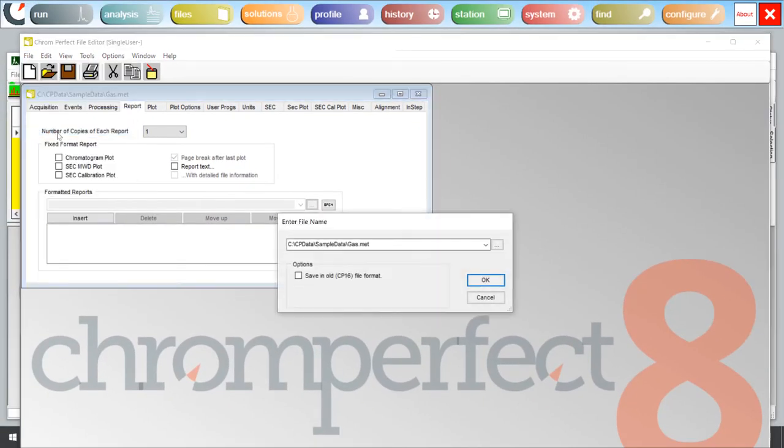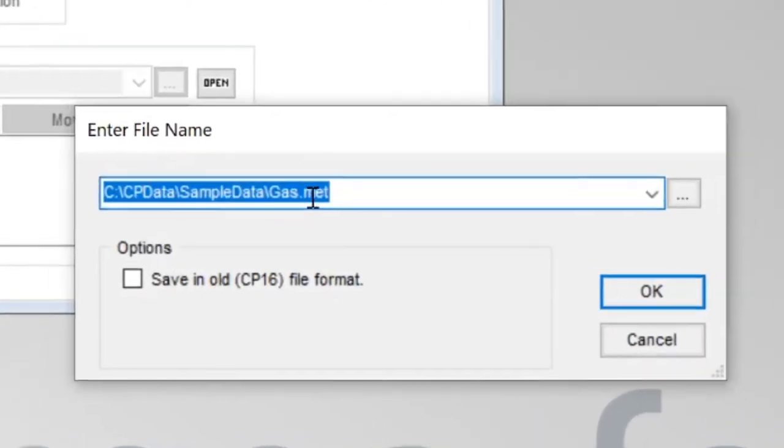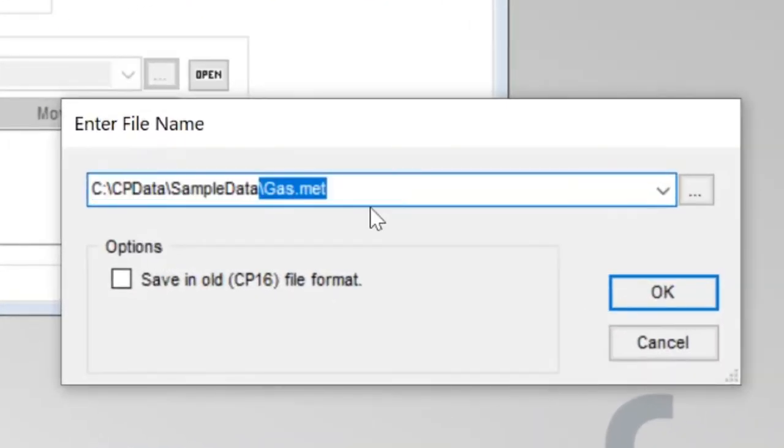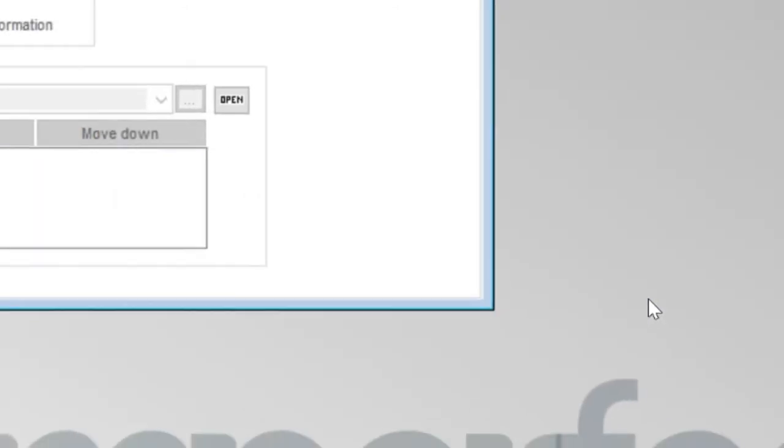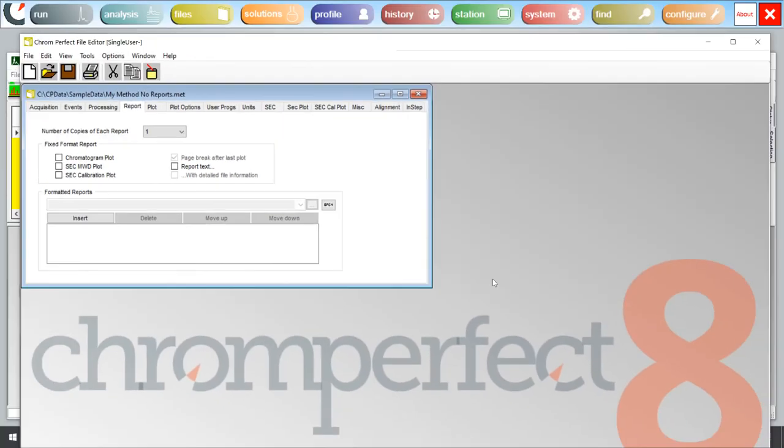When you save your method, you might consider saving as a different name. For example, mymethodnoreports.met. ChromePerfect will no longer automatically produce reports at the end of every run when this method is used to acquire data.